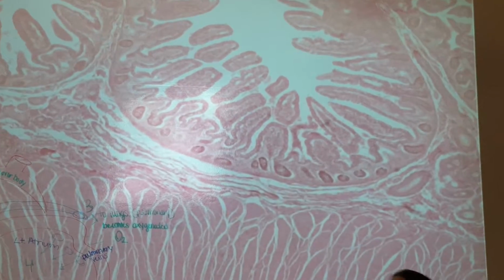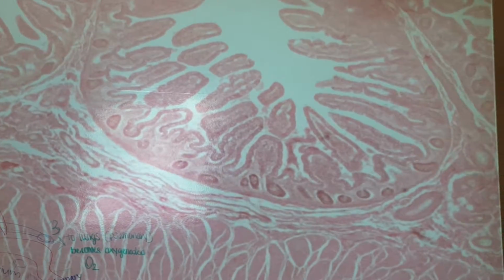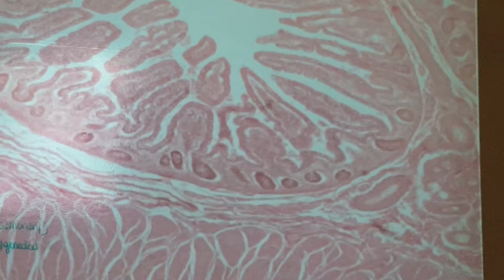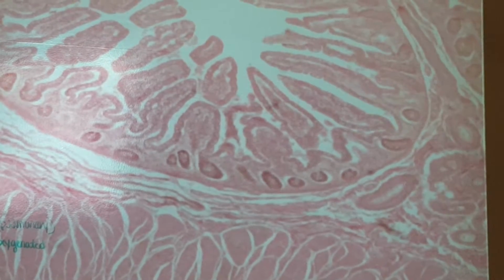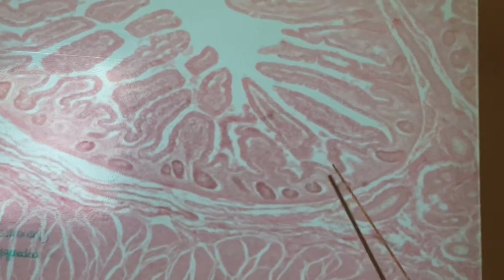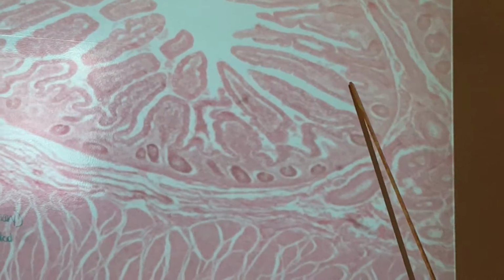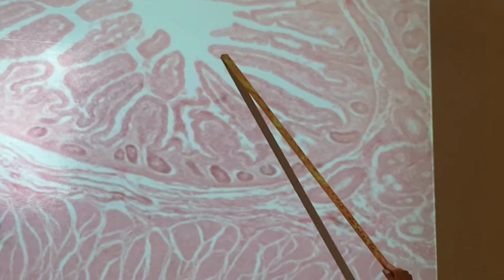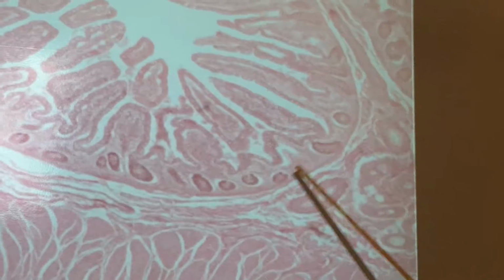All right, so again, you should be able to recognize this, and it looks kind of like the stomach. It's like the stomach, but a little more disconnected in areas, so that might be something to look for. The stomach isn't necessarily going to disconnect its lining like this. So these again are the pointed projections, the villus or villi, surrounded by simple columnar cells and goblet cells. Lamina propria fills up the projections as well as down here. What would these things be?